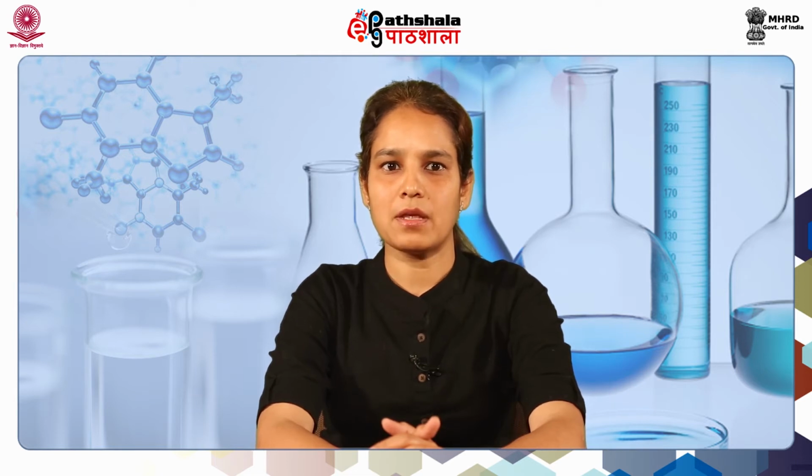Energy gap between bonding or non-bonding orbital and anti-bonding orbitals must coincide with the energy of light, which of course is dependent on its wavelength, for an electron to get excited. Therefore, light of this defined wavelength is absorbed by matter.